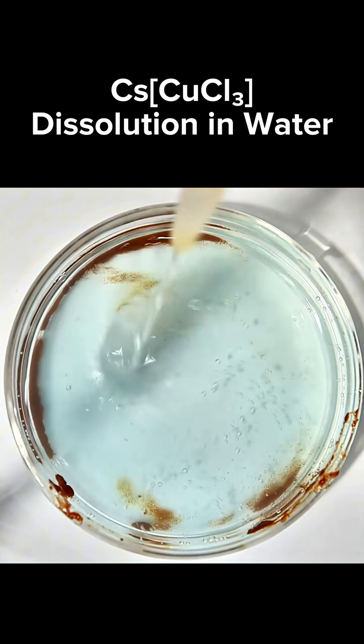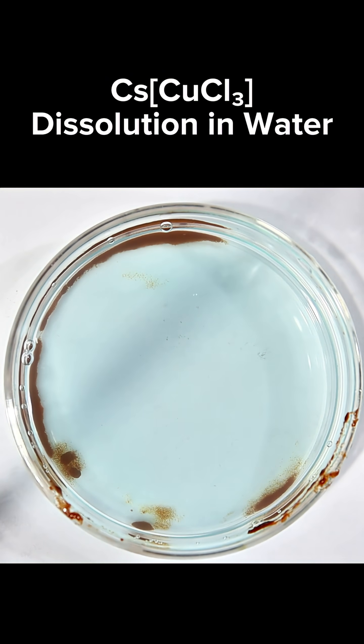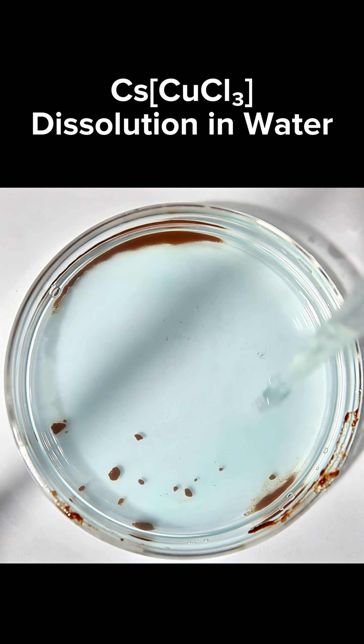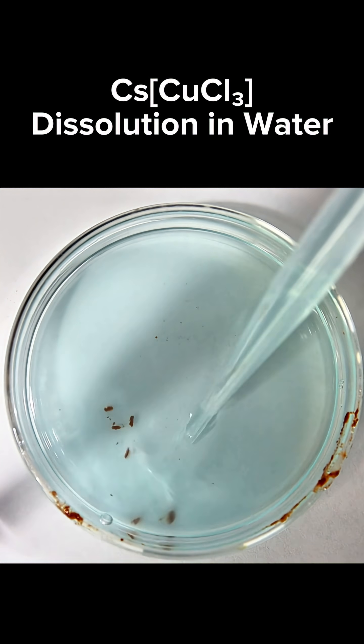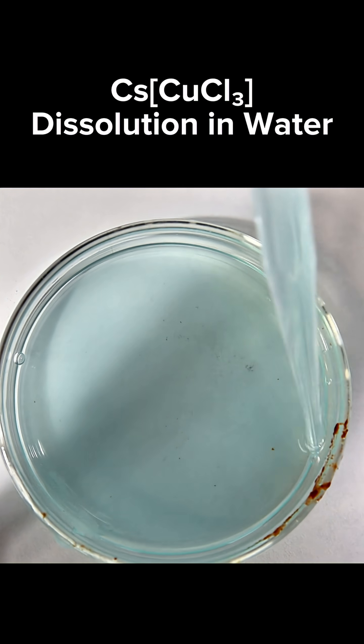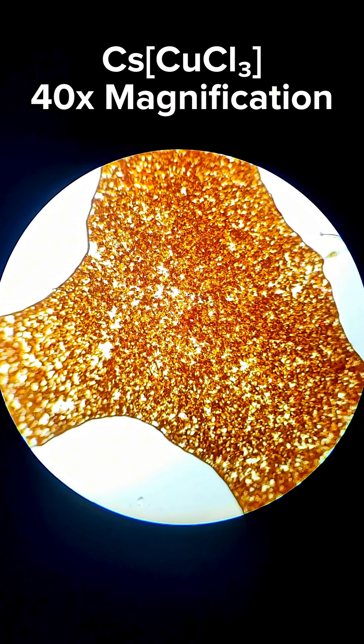Anyway, I ended up doing this reaction several times under a microscope, which I think looked incredibly stunning. I got some really good footage that I'm going to let play out, so if you liked this video and you'd like to see more like it, consider giving me a follow.